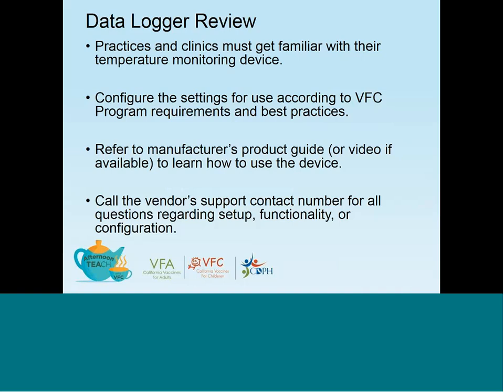There are many data loggers on the market today, each with their own set of guides and instructions. This webinar will not cover how to operate individual models, but will cover VFC requirements for compliance. It is imperative that practices and clinics are familiar with their particular temperature monitoring device.